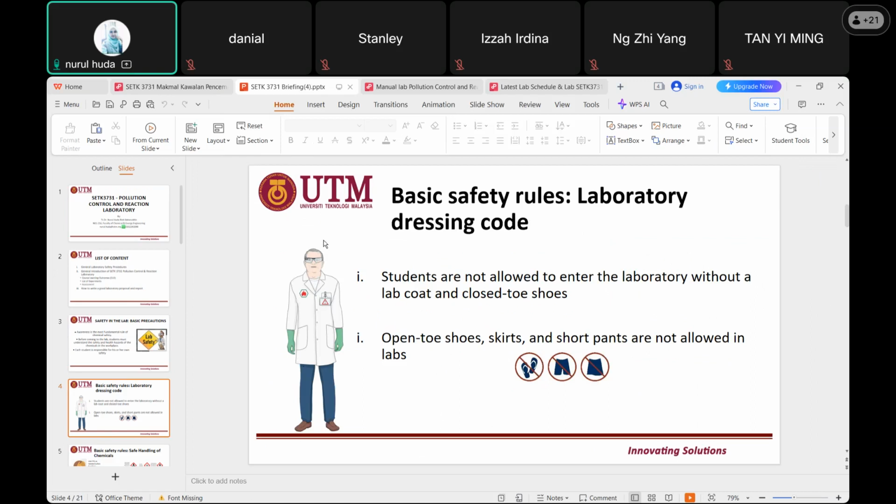If you have specs, that is okay, but if you are dealing with heavy metals or hazardous materials, you need to wear goggles. Every week, you also need to manage yourself to have long sleeve attire and long pants. Alright, so if a chemical splashes onto your skin, you can avoid harm like this, right?